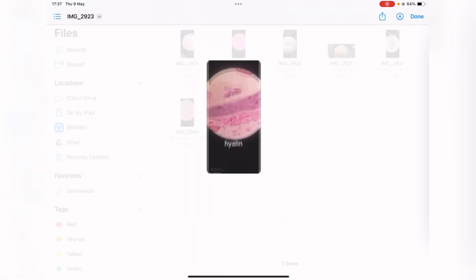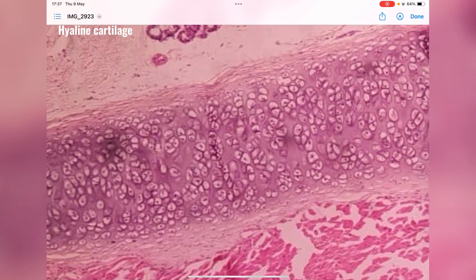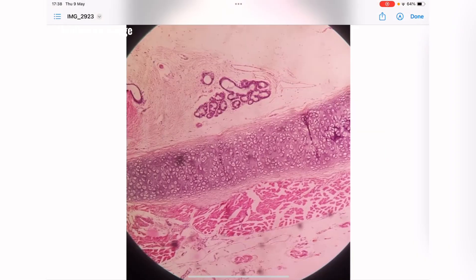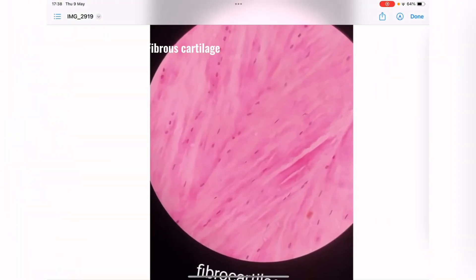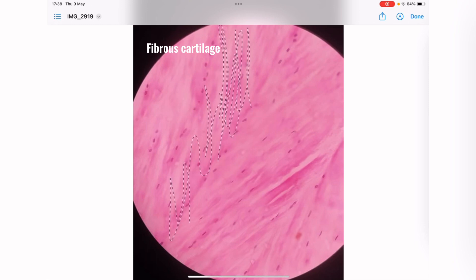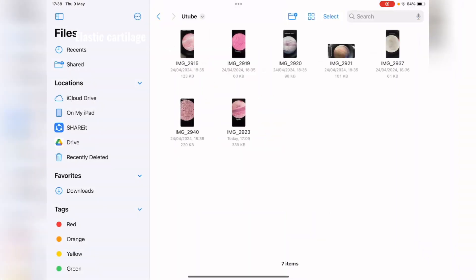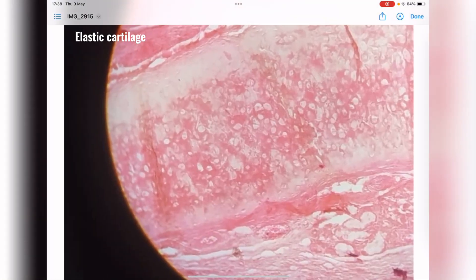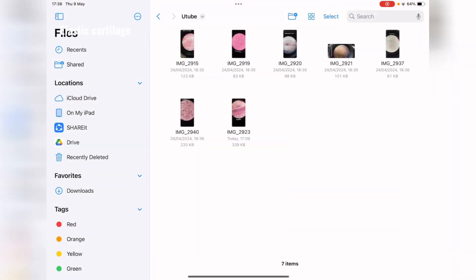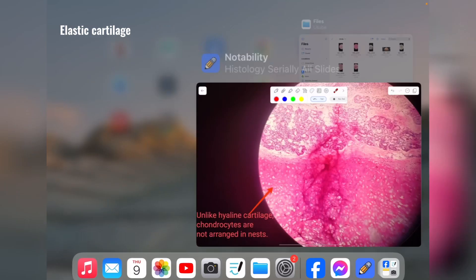Here is hyaline cartilage: you can see multiple chondrocytes present inside the same lacuna forming nests, and the matrix on which they lie is clear. Next, there is high deposition of white fibers with chondrocytes lying on them in a streak-like series — this is fibrous cartilage. Here is another cartilage where chondrocytes are inside lacunae individually and the matrix is opaque due to deposition of yellow fibers — this is elastic cartilage.